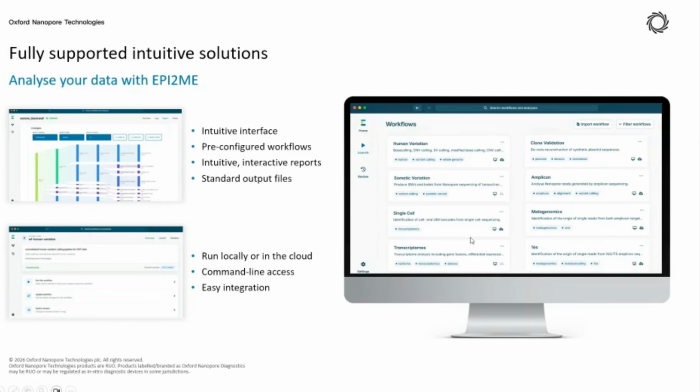So we do not really need any command line knowledge in order to run the analysis using EPI2ME. It comes with pre-configured workflows or pipelines. That also means that we do not really need to identify the steps that are required to do the analysis. Some common pipelines have been established, so we just need to follow through or select the right one in order to process our data.